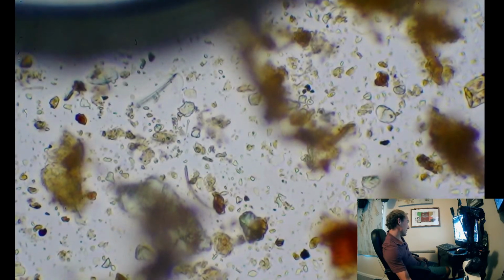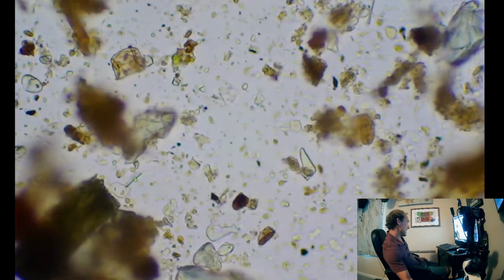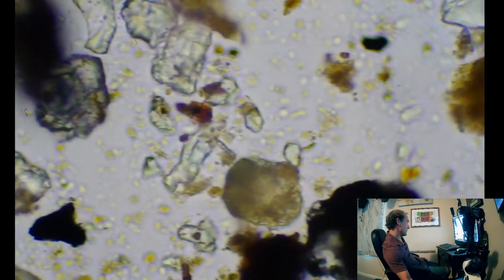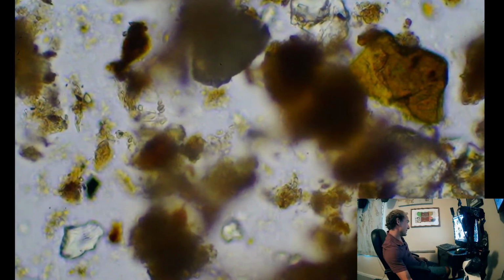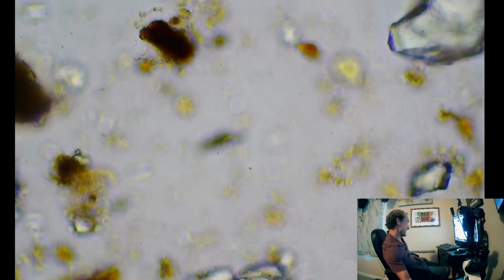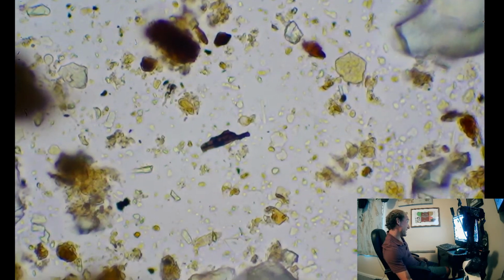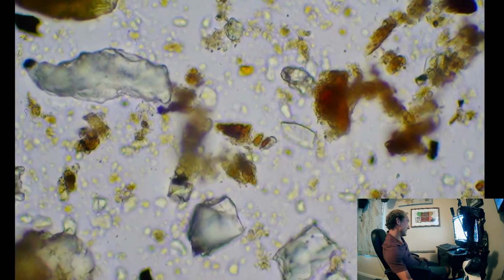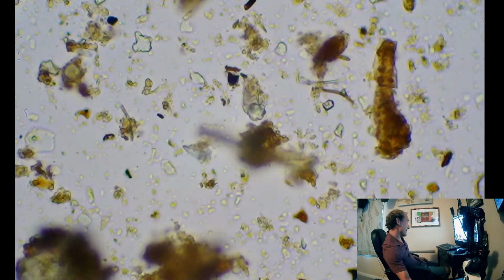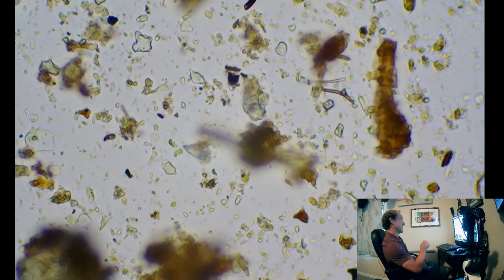And a fungal, oh, there's one. Every 1, 2, 3, 4. Yeah, 1 to 5. 1 to 6. Oh, did we have one here? Alright, yep. 1 to 6 it is.